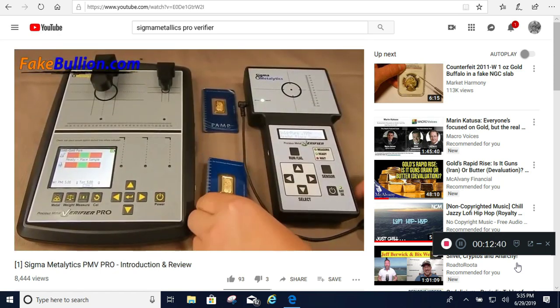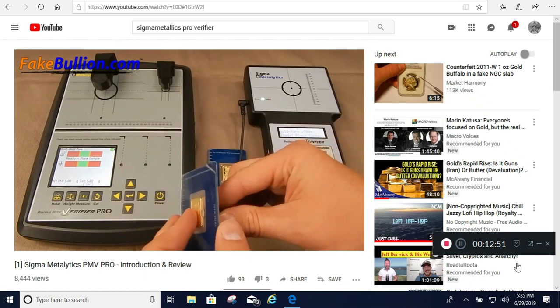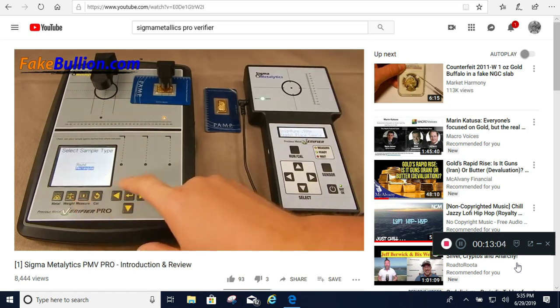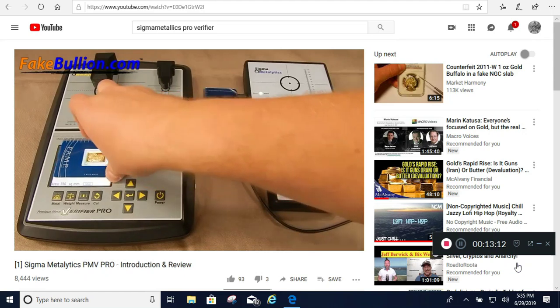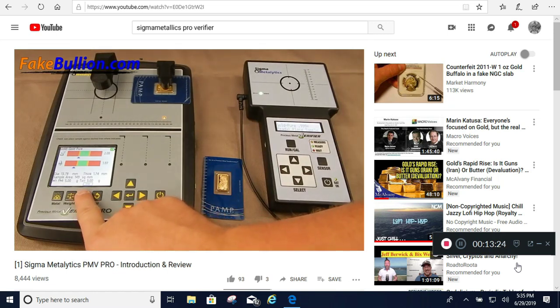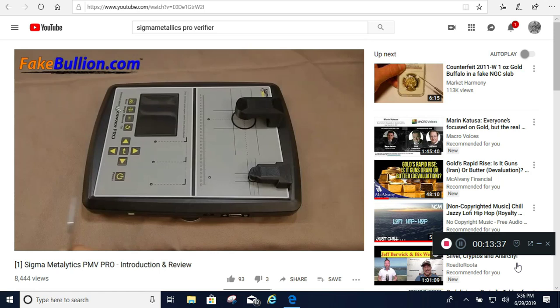Let's test another item that can be problematic on the original PMV. Some counterfeit gold bars are produced with a copper alloy that matches the resistivity of gold, causing a counterfeit bar to read as real gold on the original PMV. One of these five-gram gold bars is real and the other is fake, yet both result in readings inside the brackets on the original PMV. On the PMV Pro, the first bar gives both surface and through values in the green, and the size of the bar is validated. On the second bar, the through resistivity value is slightly into the red zone, and the bar is significantly larger than the acceptable size — the PMV Pro is able to distinguish the genuine and counterfeit bars.